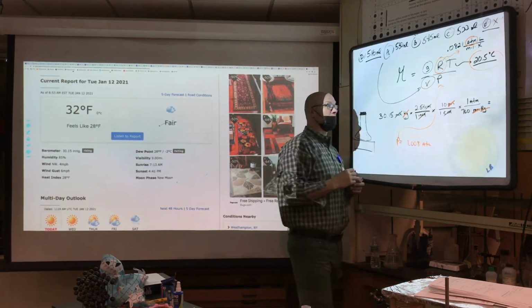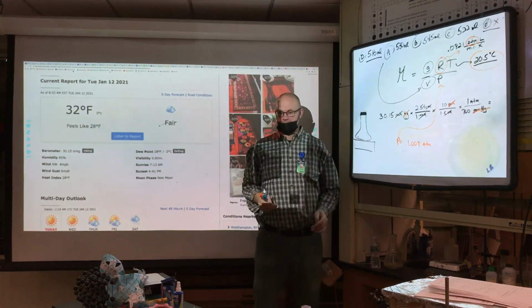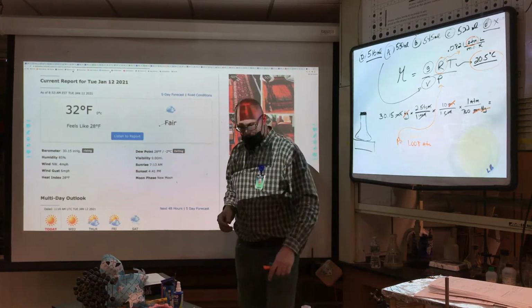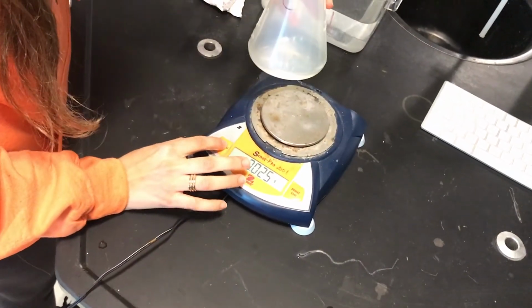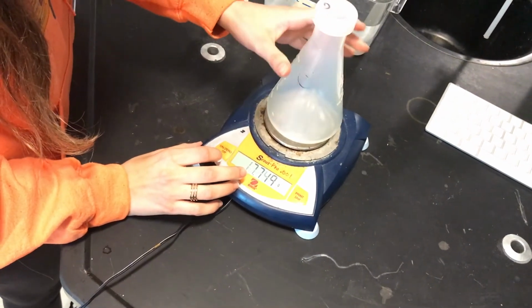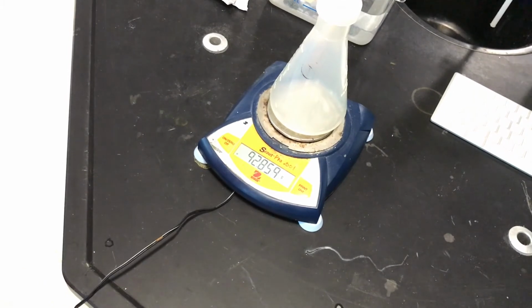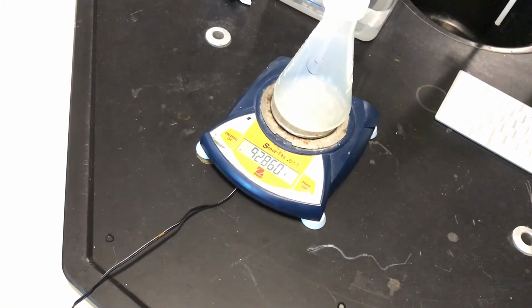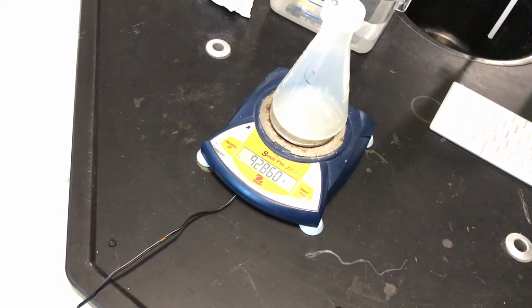All we need to do to figure out our molecular mass is find the mass of our 2 gases. So we're going to move to the tables in the back. Come with me. 92.859 we can use. Yep. What is it? 92.859.